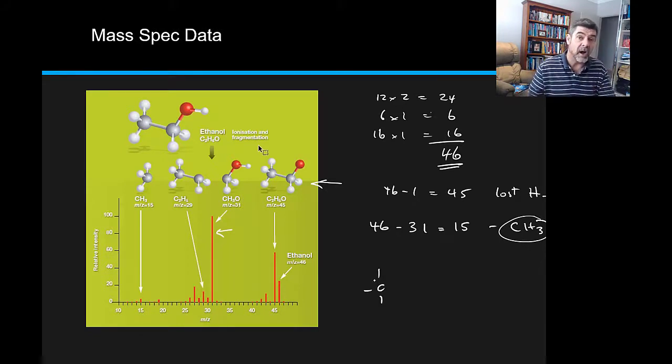Now it could be at either or both ends. It's not telling us how many there are at this point in time. It's just telling us that when this particular molecule fragments, one of the fragments that can be ripped off it is a CH3 group.